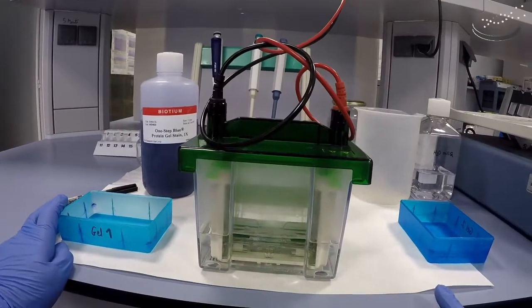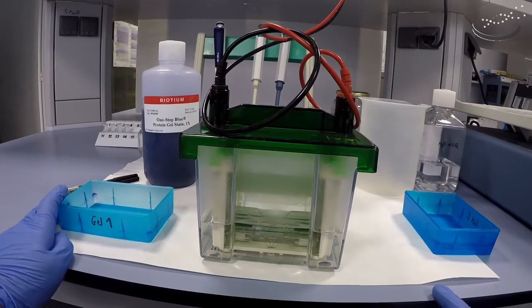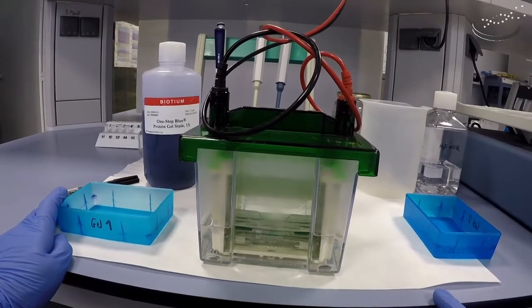In this video we're going to show you how to stain a polyacrylamide SDS-PAGE gel that we have run in the BioRad electrophoresis system.